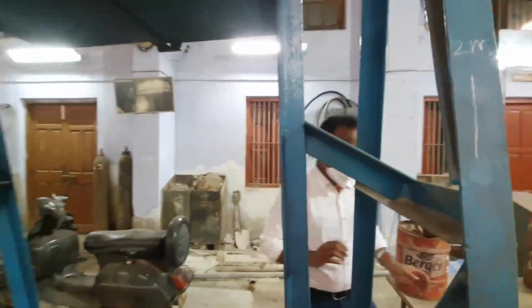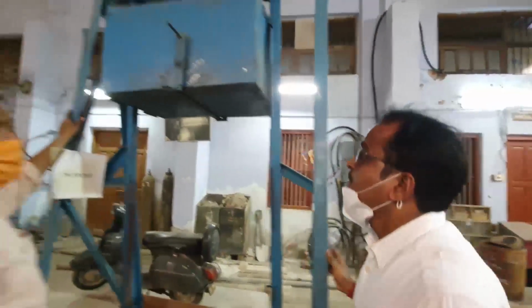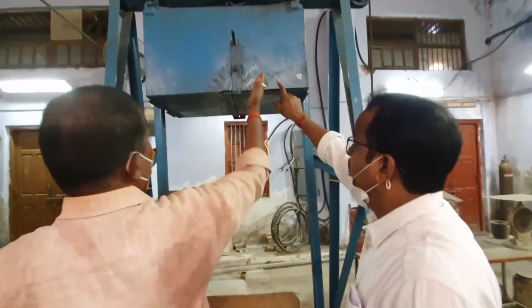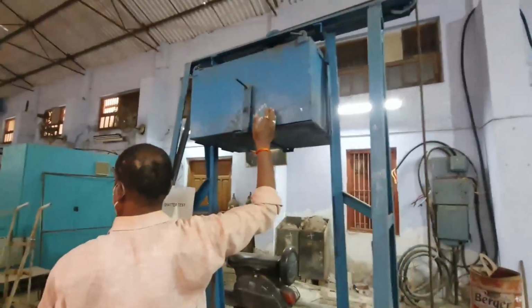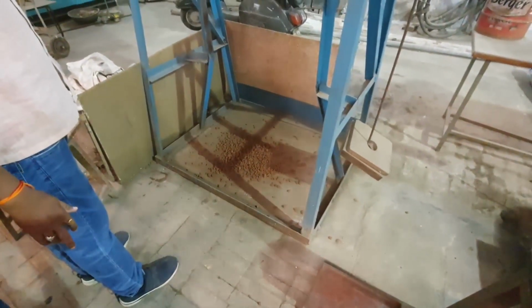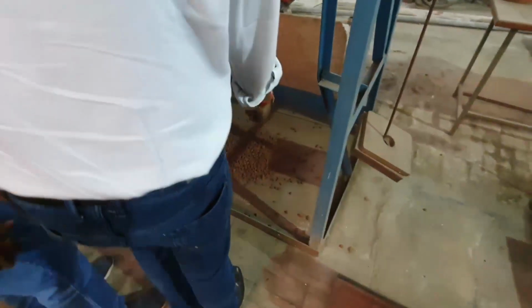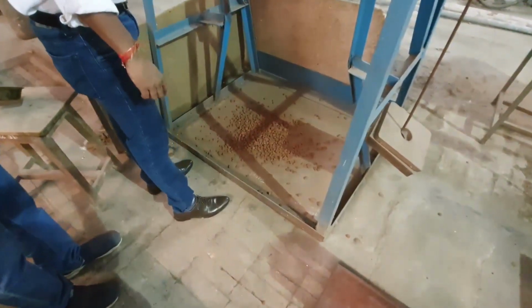Now it is right. Now we are going to open this one. Now we are going to open the first. So the material has fallen on the steel plate. So we will collect this material. Again we will make it ready for the next drop.